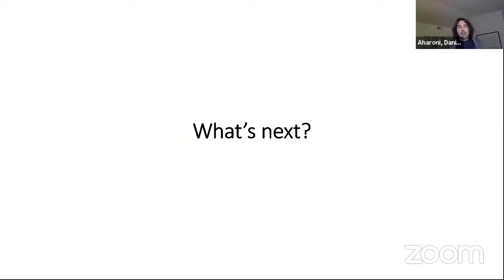I think I'll stop there. We're moving towards trying to get as much data out of the animal as robustly as possible in as freely behaving natural environments as possible. So our group now is pushing towards trying to build fully wireless miniature microscopes. So wirelessly powered and wirelessly transmit data that can be chronically recorded onto a mouse in a colony of mice.